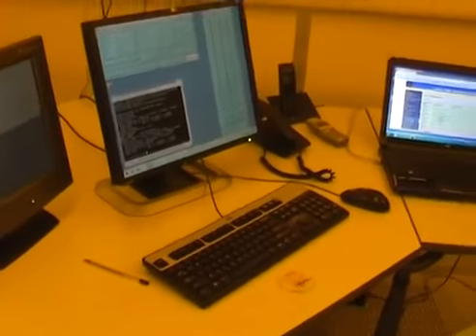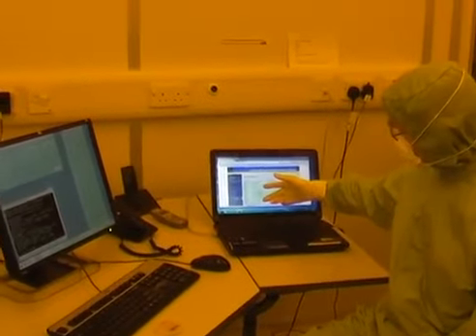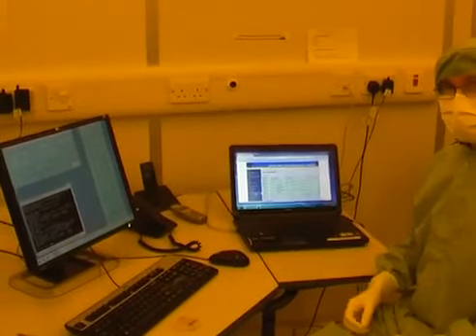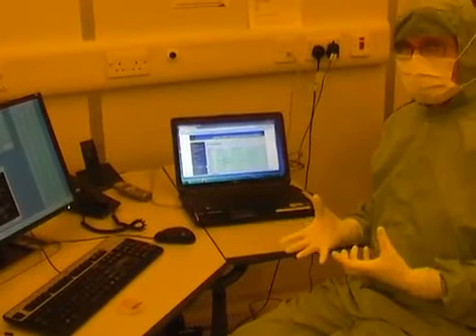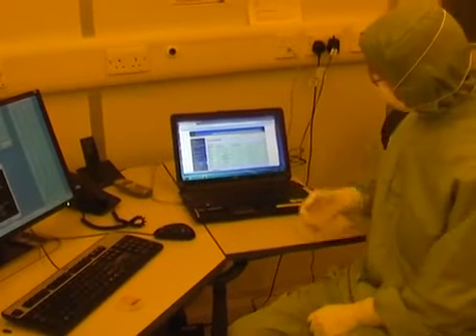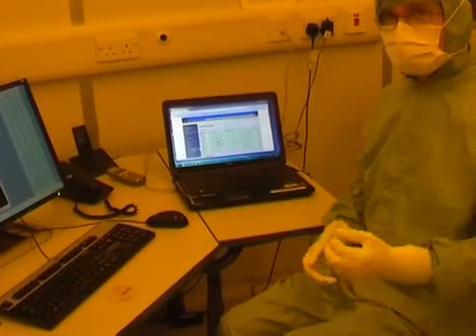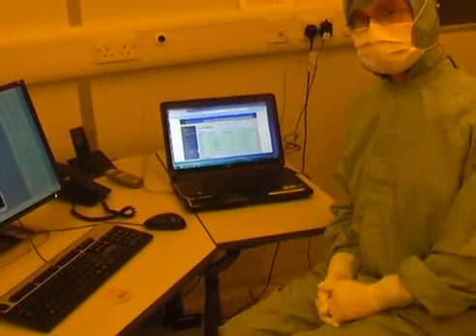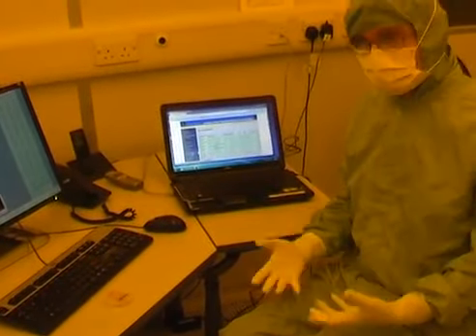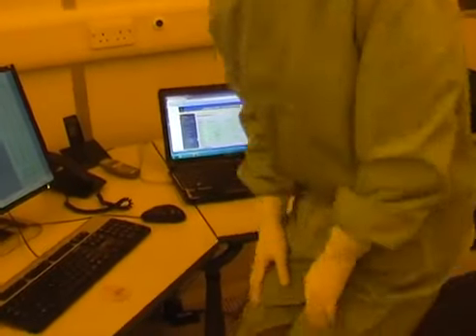One of the big problems we have is that samples are often here, but they're not in the box outside, or they're in the box outside, but they're not here. We can only load a job if it's in both places at once. And you'll notice that there are about 8 jobs here, but there are only 2 samples outside. This is a constant frustration for the operators. They come here and the jobs are not ready to be loaded. Okay, let's go in.